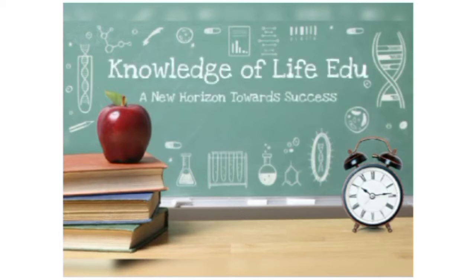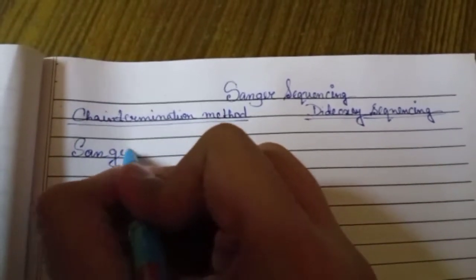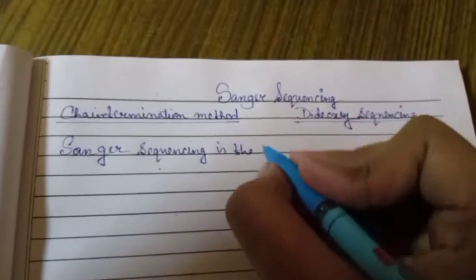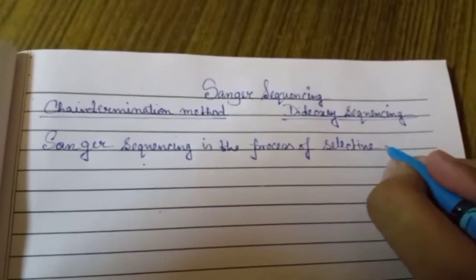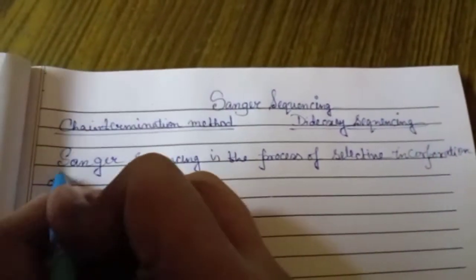Hi guys, in this video I am going to talk about Sanger sequencing. Sanger sequencing is the process of selective incorporation of chain terminating dideoxynucleotides by DNA polymerase during in vitro DNA replication.